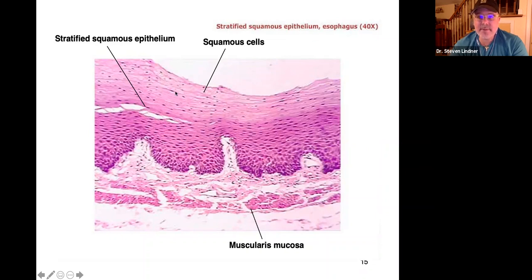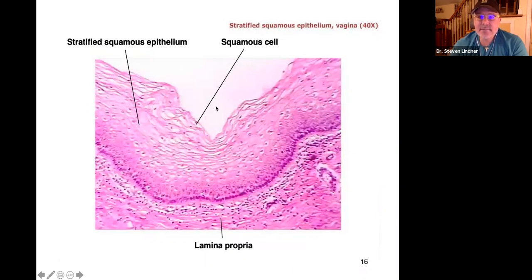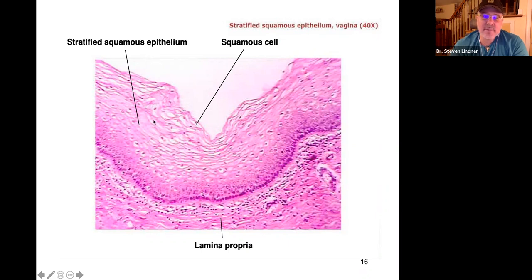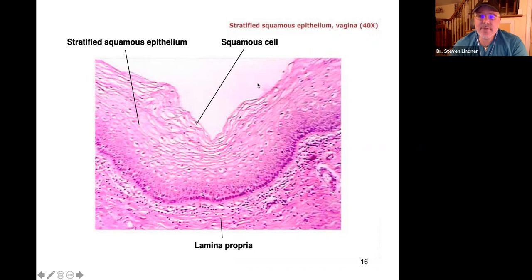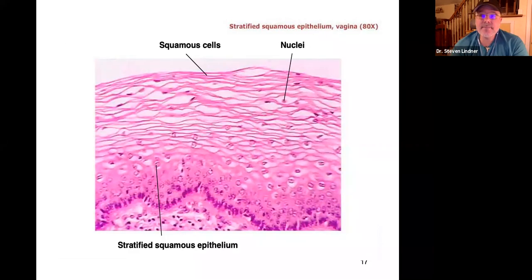Here's the vaginal area — here's the lumen. You see flat, irregular-shaped cells, but not one cell layer thick: multiple layers. So it's stratified squamous epithelium. This area is subject to abrasion and friction, so multiple layers of protection are needed. The outermost layers are dead cells that will eventually slough off, and the body makes more. Flat, irregular-shaped cells — many of them — stratified squamous epithelium.